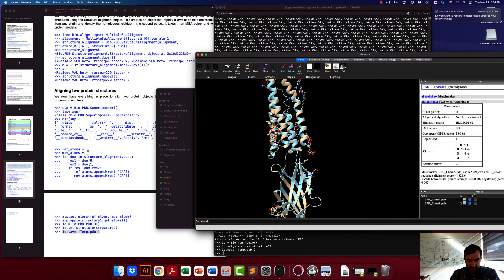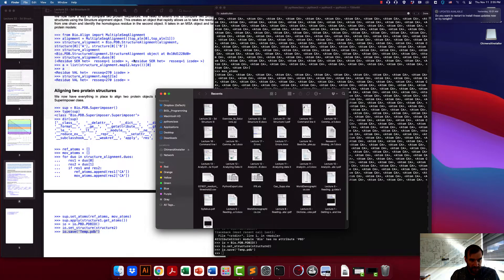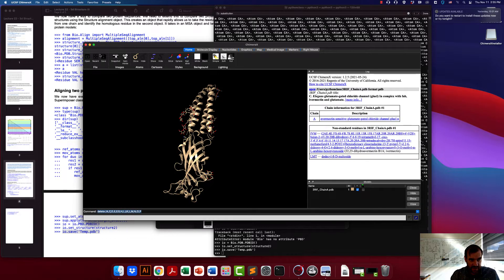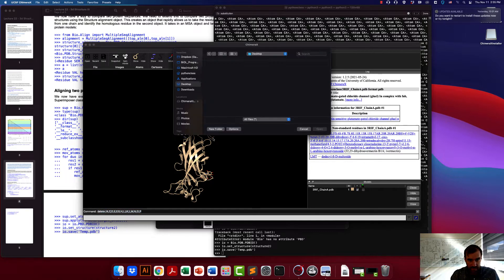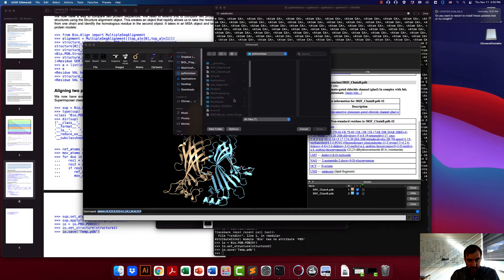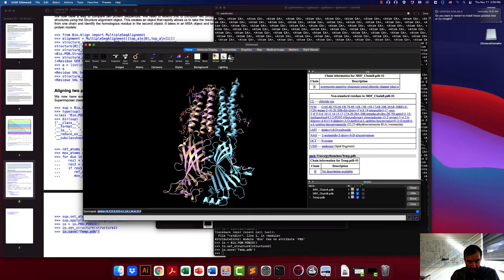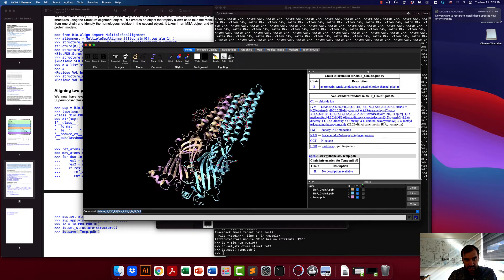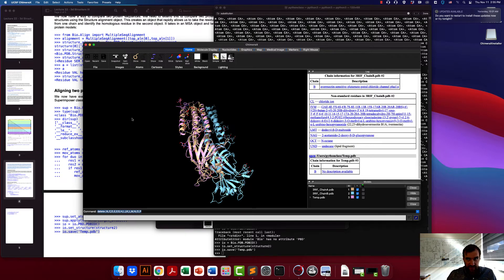Let's verify this in Chimera. We reopen Chimera, load chain A, chain B, and now open the temp file of the moved structure. We can see that we have moved the B file so that it's aligned in the new position. I know it's complicated and you'll probably have to go through this a few times, but it's really good to understand how this whole process works. If you follow this process you should be able to pretty straightforwardly align two proteins together.